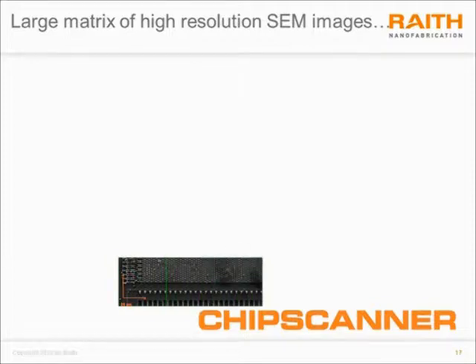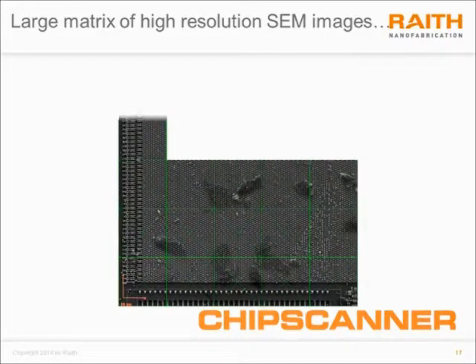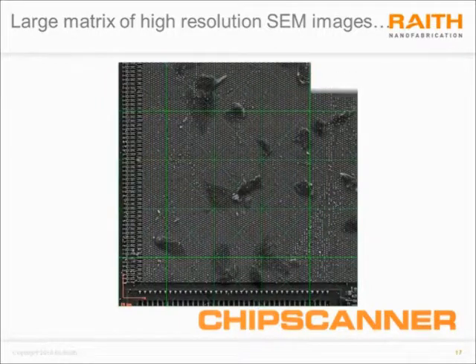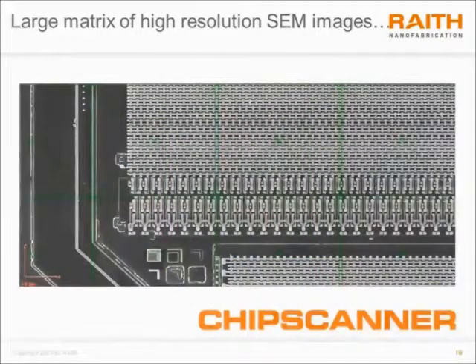Next, the laser interferometer moves the sample and an image is captured. And then it moves the sample and an image is captured, and this is just repeated over long time periods to cover large areas of this particular layer. So now we have about 250 by 250 microns of image captured. Let's have a closer look.